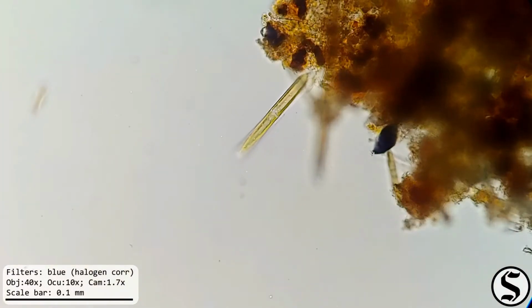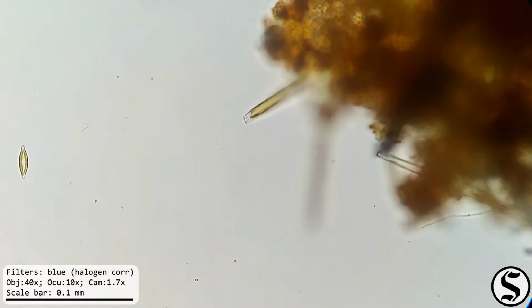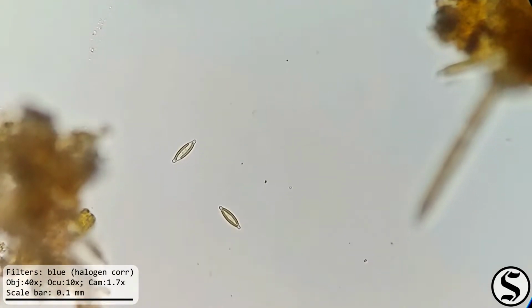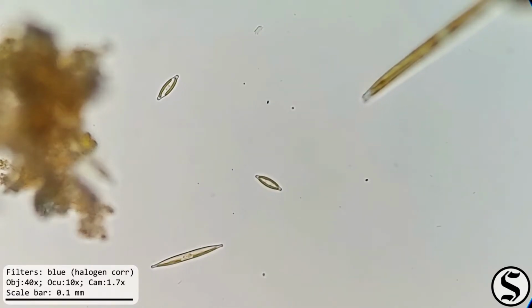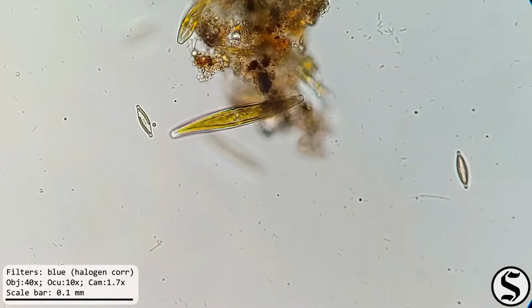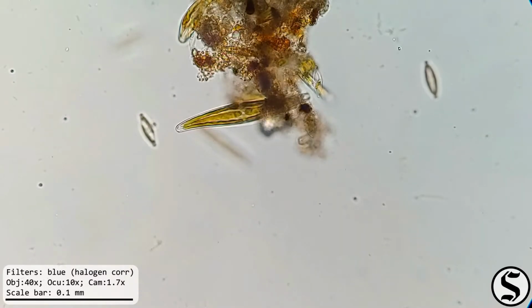Under really high magnification, we can see that we've got several different types of these little guys. They are definitely three-dimensional, so changing our focus lets us see different parts of them. And there are just so many forms. We've got little ones, we've got big ones, some have little knobs on the end, some are long and thin, some have a bit of a wave to them.